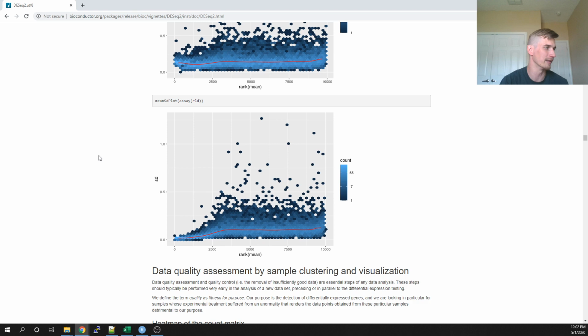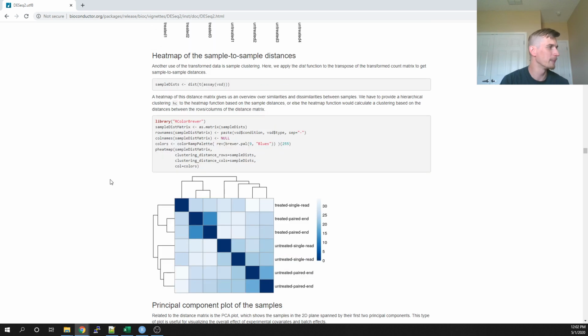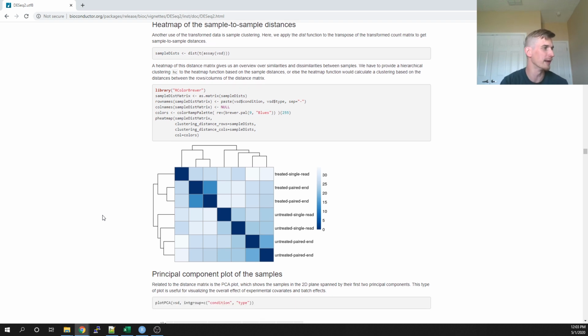These are heat maps. This is more or less comparing samples to each other. It's a visual way of measuring how similar two samples are to each other, and then plotting those metrics of similarity out in a pairwise fashion. So this is one thing that we'll try today.